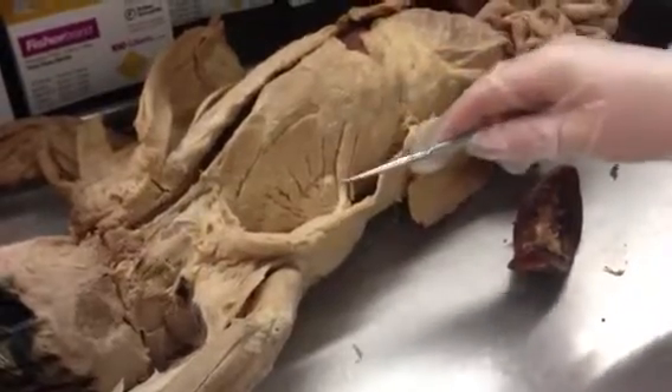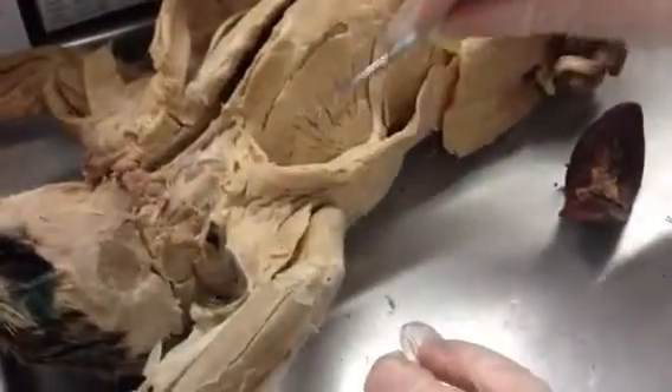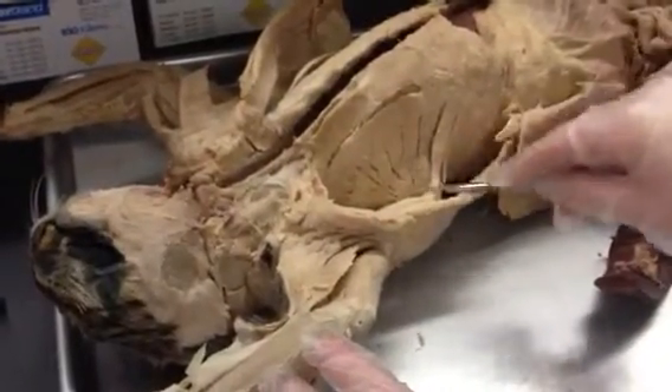So the deep muscles of the chest and thorax — this one here that looks like a fan or a seashell, remember that? That's called the serratus ventralis. Right, the serratus ventralis.